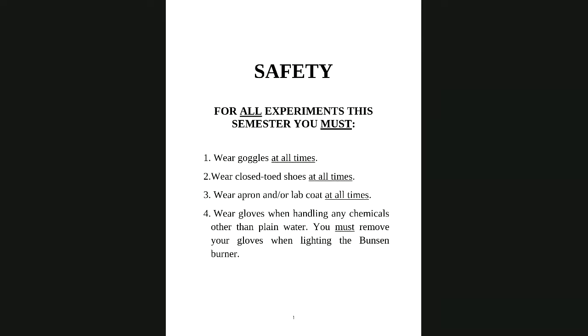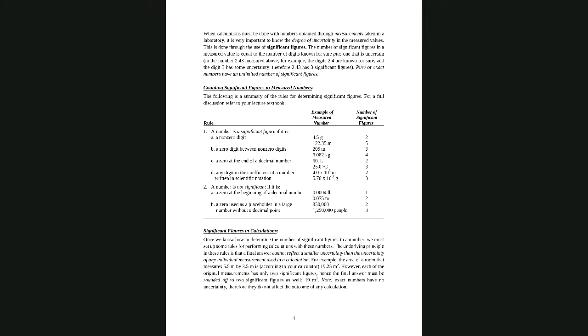You can read the experiment, which is available to you in detail in a folder called experiment 1 document. The first document contains the experiment and the introduction theory part, including how to read a measuring device, if it's a ruler or graduated cylinders. For measuring length, you would use a ruler or meter stick, and for measuring volume, you are going to use a graduated cylinder. You could use a burette, you could use a pipette.